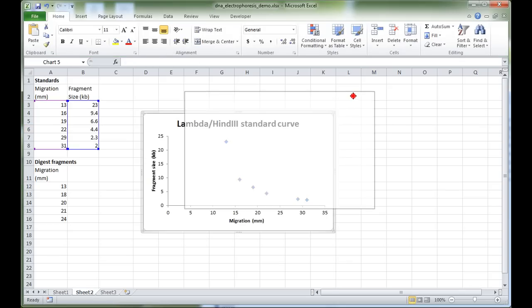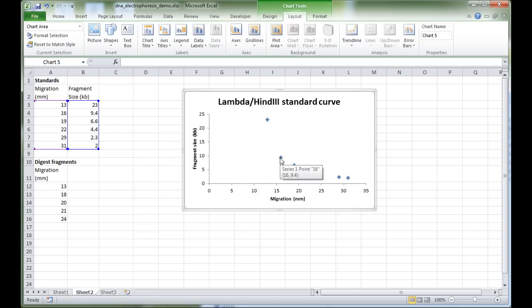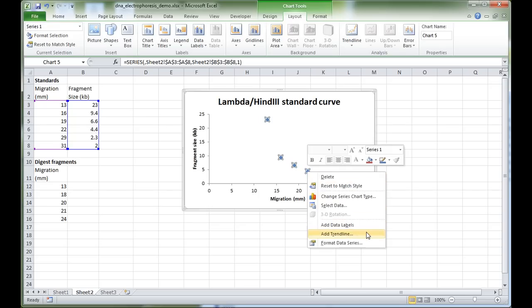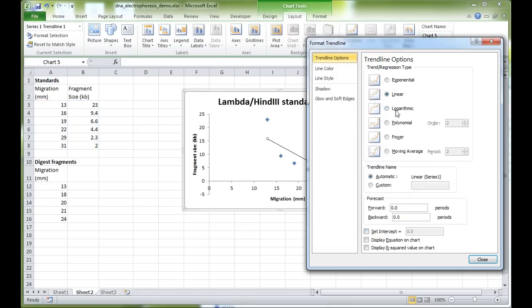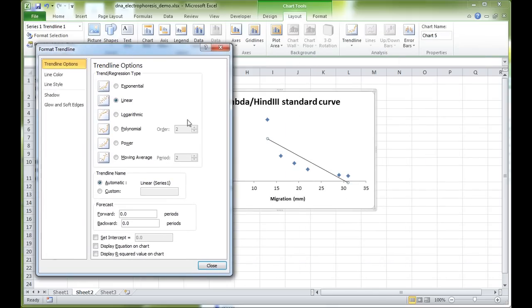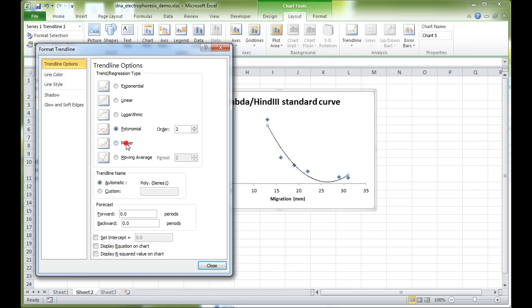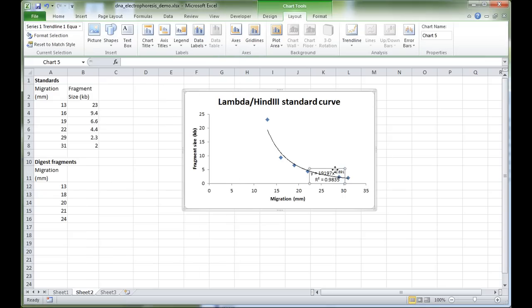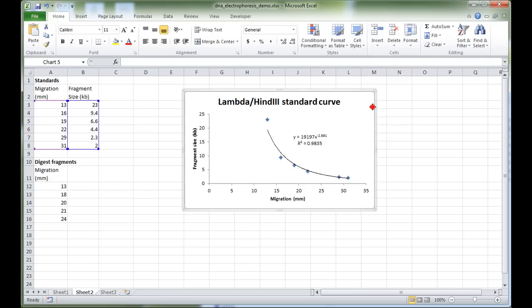We can add a trendline — a mathematical relationship between the x and y axes. Right-click on the series and select 'Add Trendline'. The linear option is not a good fit; polynomial is okay; power looks much better. We'll display the equation and the R-squared value, then click Close and drag the equation to a more sensible position.